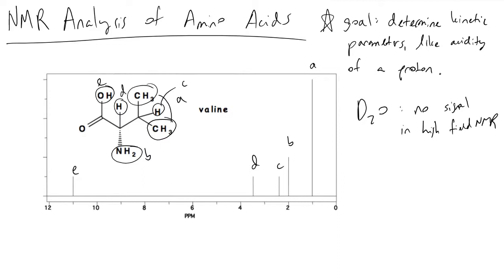And so, as we'll recall from general chemistry and some organic chemistry courses, when a molecule is present in solution, like an aqueous solution, there's going to be some protons floating around here and there. And if we introduce deuterium, there's going to be some deuterium atoms as well. And these deuterium atoms will exchange on a molecule. And if we wanted to determine what kind of protons on valine are acidic, we can do that by adding a few drops of deuterium onto valine, or into our solution.